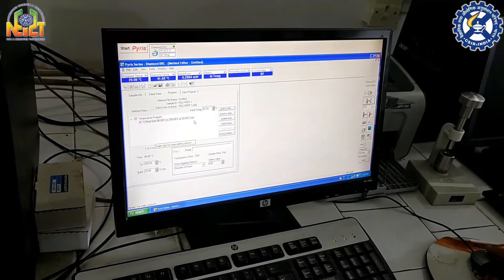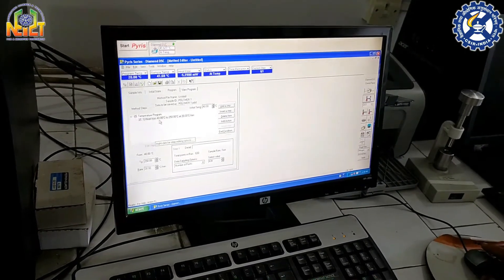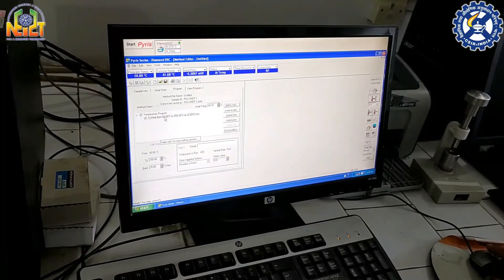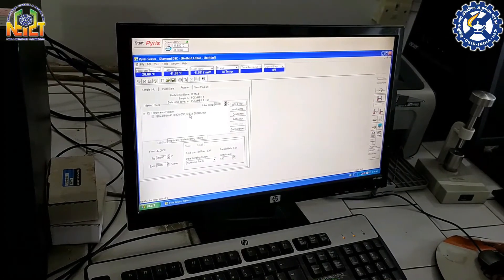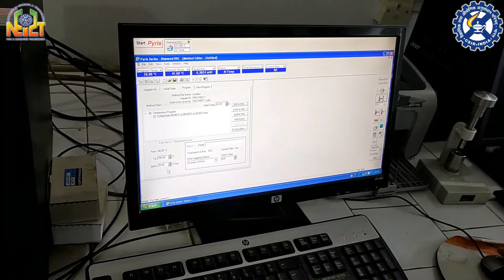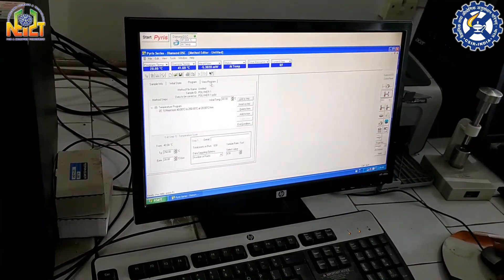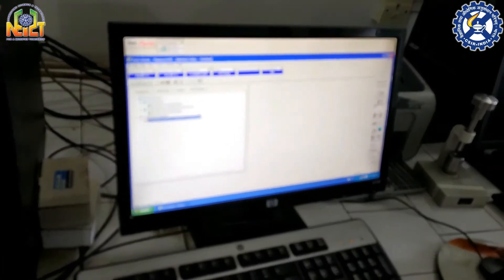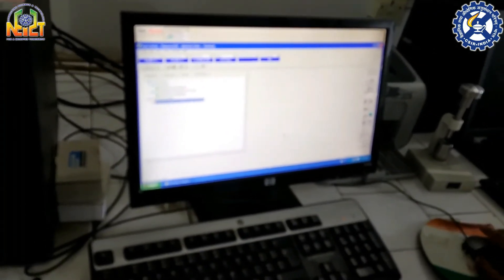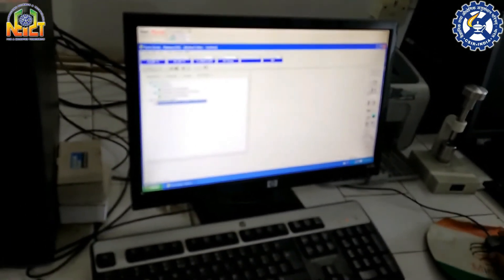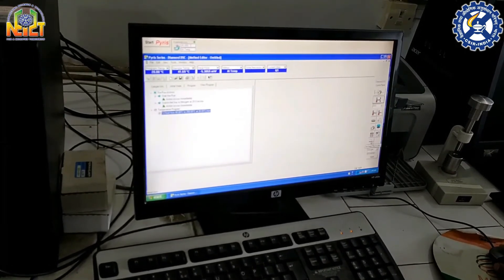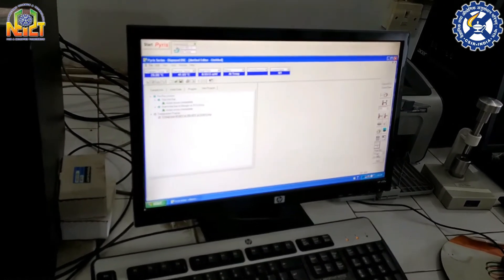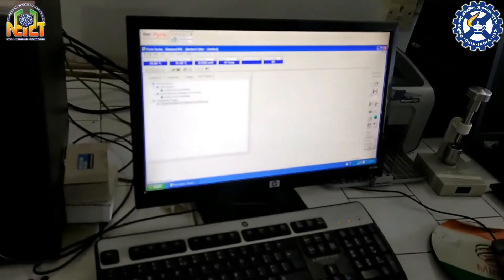The heating rate is 20 degrees centigrade per minute. Our sample run starts from 40 degrees centigrade to 250 degrees centigrade. After setting the program, we apply the purge gas, which is nitrogen.